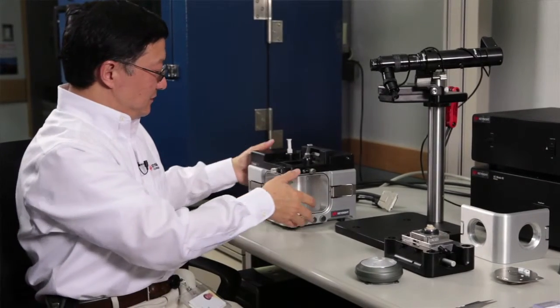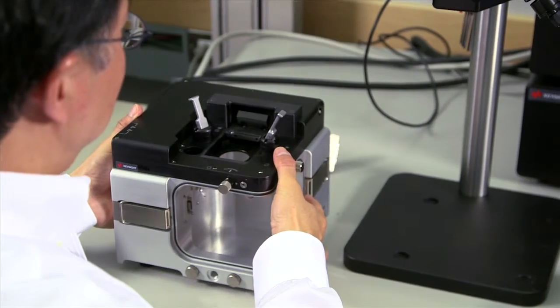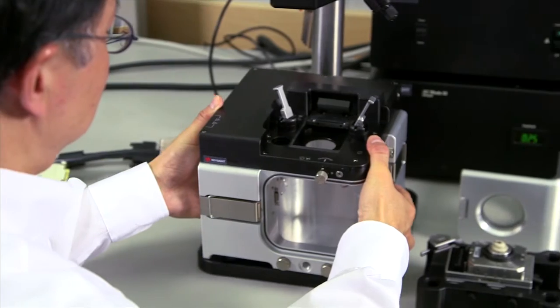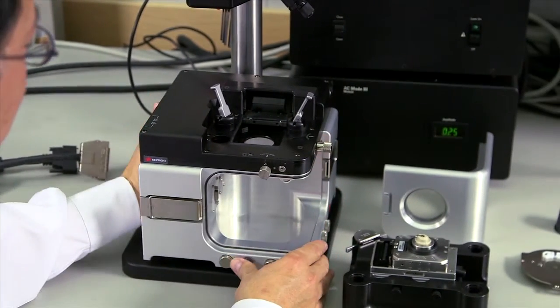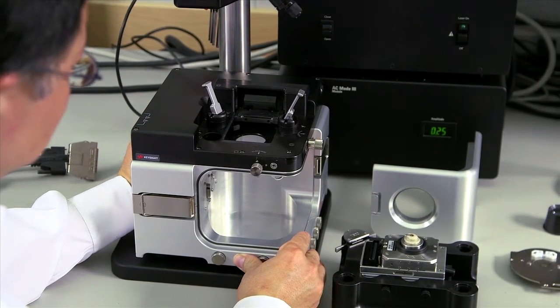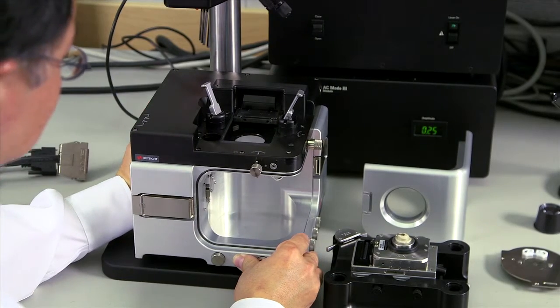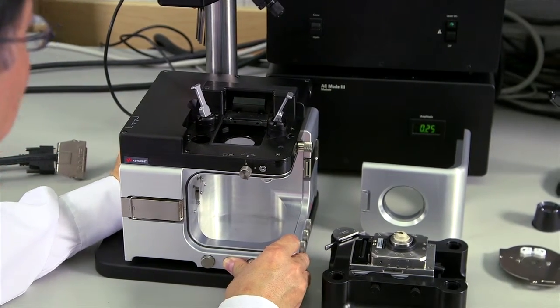The next is to set the AFM body on top of the base plate. And you can slide it back and forth until the legs fall into the four position holes in the base plate.